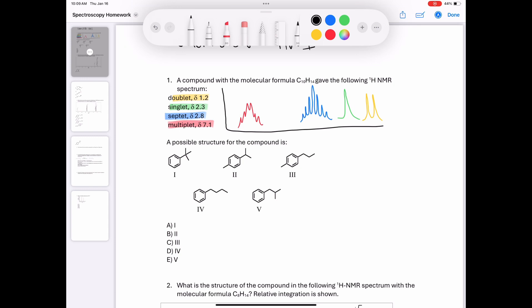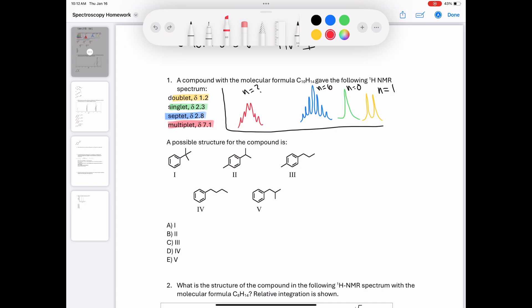The next thing I want to do is match up the N number — the number of neighbors each signal is indicating. The doublet has N=1, the singlet is N=0, the septet is N=6, and the multiplet is unknown because it's a multiplet. Based on the fact that all possible answers have a benzene ring, I think it's pretty likely that this multiplet is indicative of the benzene ring.